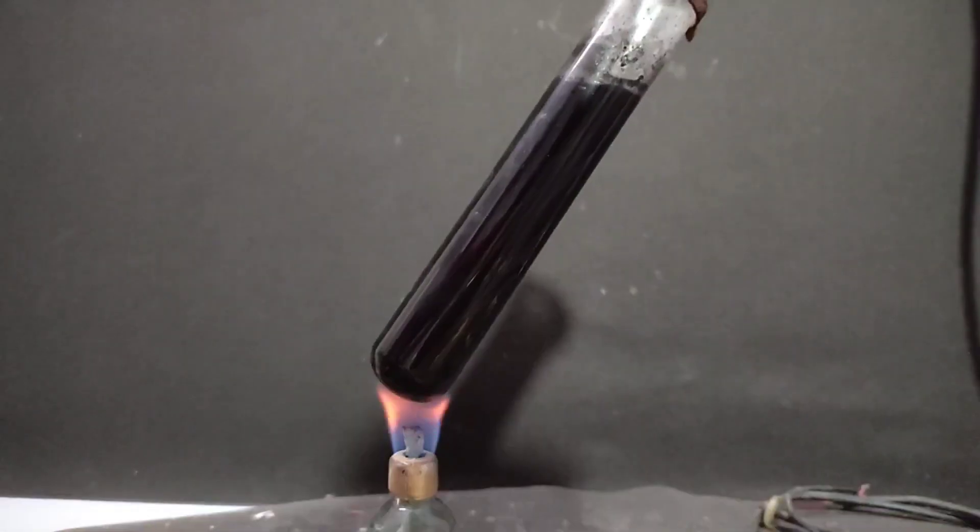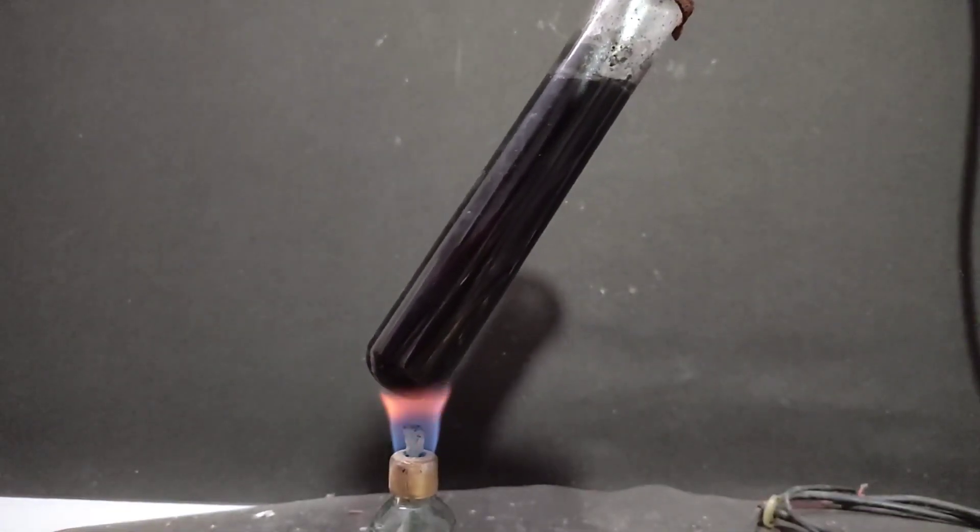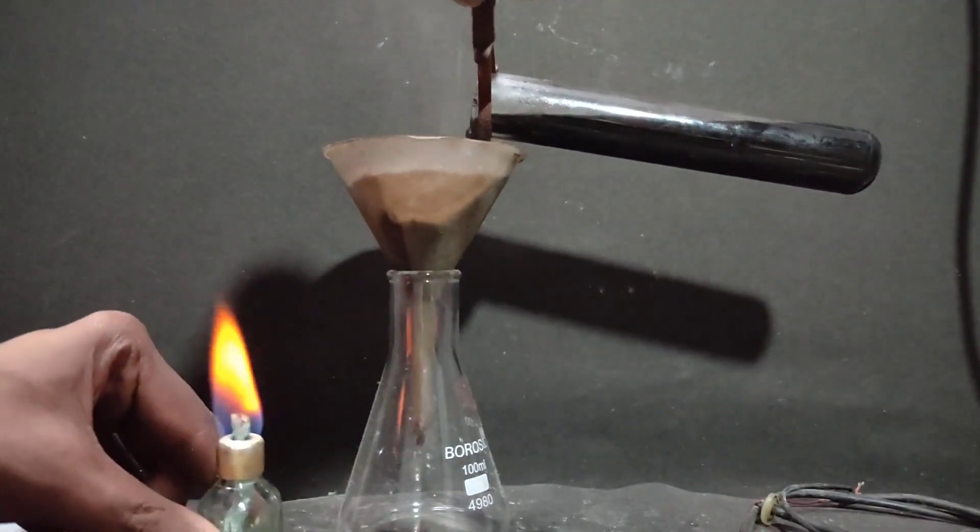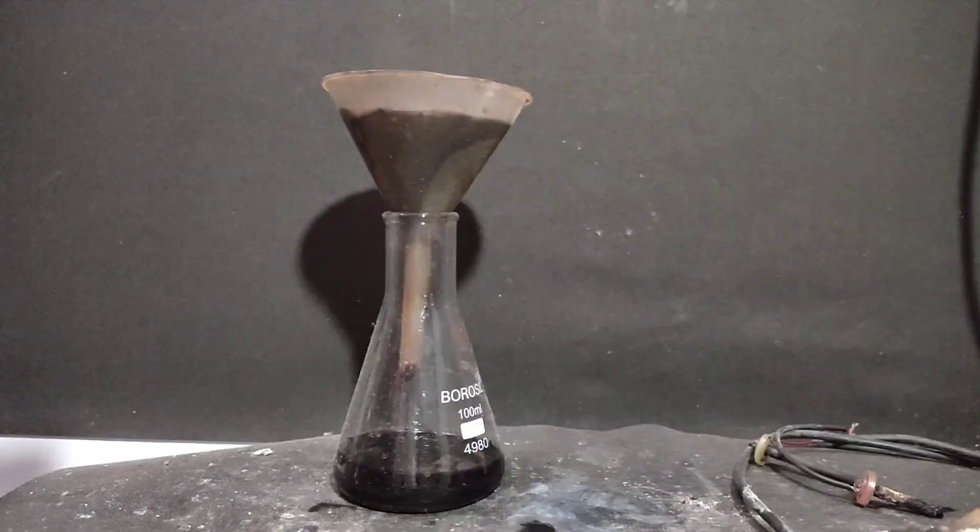After transferring everything into it, I heated it to boiling and filtered it hot to remove the carbon particles. On boiling, the solubility of potassium iodate increases, so it's important to filter it hot.